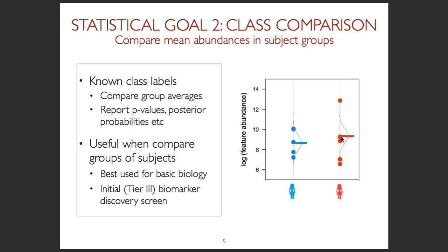And again, for those of you who are just joining us, I'm talking about differences as opposed to ratios, because everything we do this week, we talk about feature intensities on the log scale. So everything we'll do, we'll first take a log, right? And the log of a ratio is a difference of the logs.